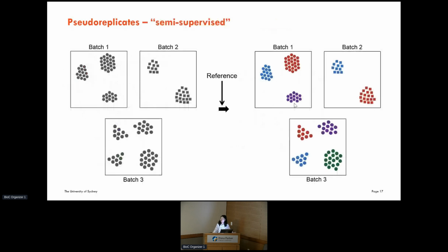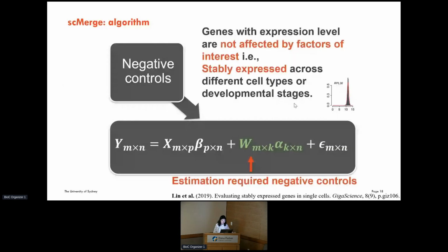And this version sometimes works better than the default clustering method, because sometimes using a reference can annotate the rare cells better than using clustering to identify the rare cell types. So it will help in the mutual nearest cluster matching step.